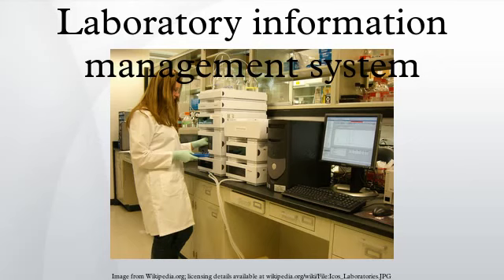Electronic data exchange. The exponentially growing volume of data created in laboratories, coupled with increased business demands and focus on profitability, have pushed LIMS vendors to increase attention to how their LIMS handles electronic data exchanges. Attention must be paid to how an instrument's input and output data is managed, how remote sample collection data is imported and exported, and how mobile technology integrates with the LIMS.